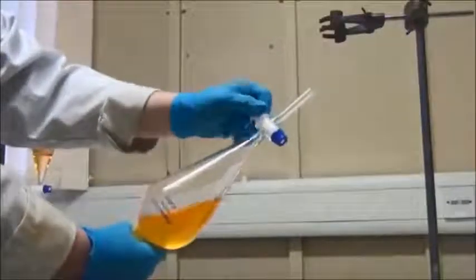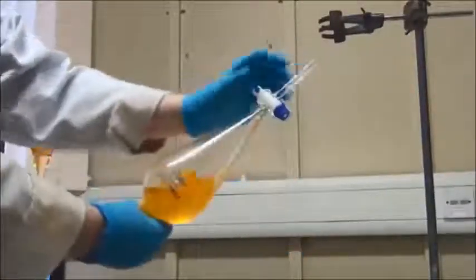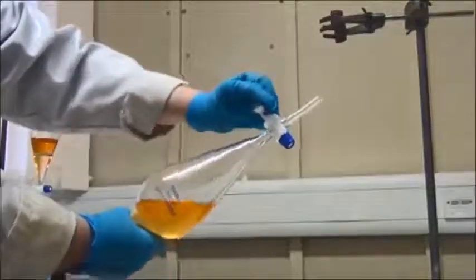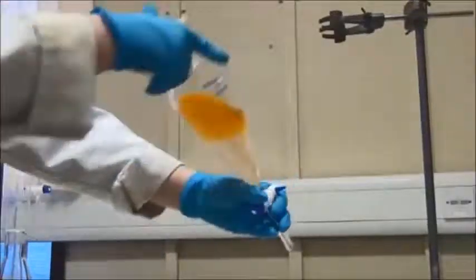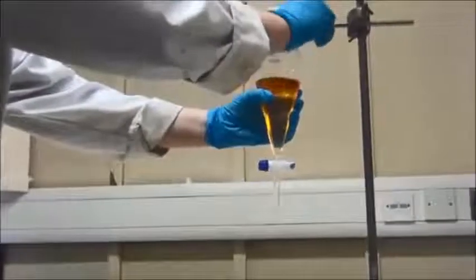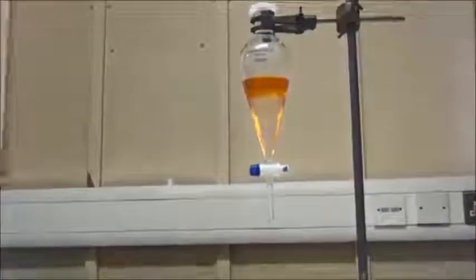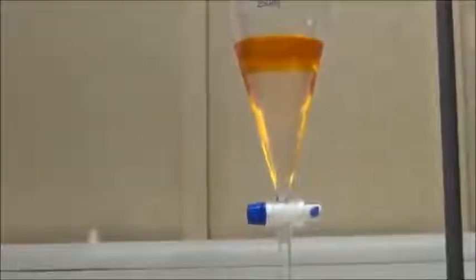To ensure maximum mixing and maximum separation, you should repeat the process of 2 to 3 inversions followed by the opening of the tap another 5 to 10 times. Then securely attach the separating funnel back in the clamp or ring and watch the layers begin to separate. This separation shows that the dye that we added has gone into the organic phase, which is why the bottom aqueous phase has lost its colour.